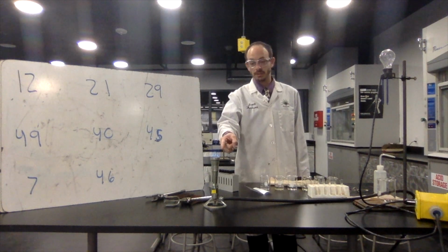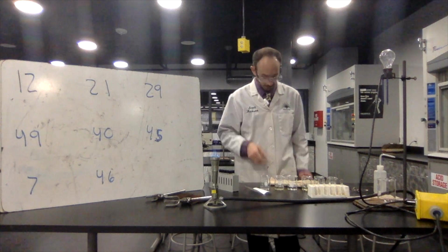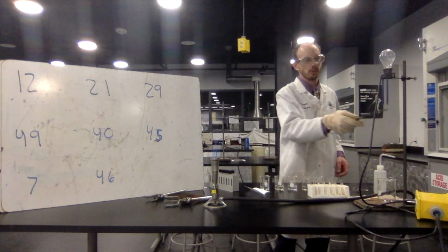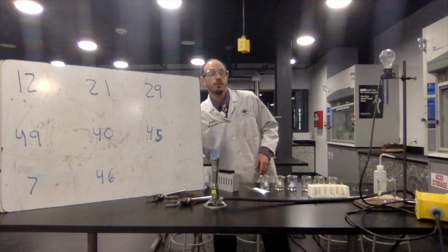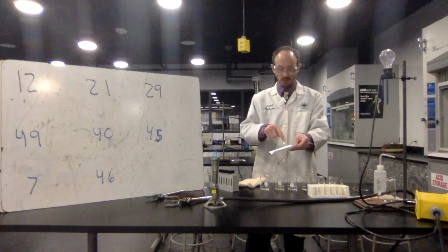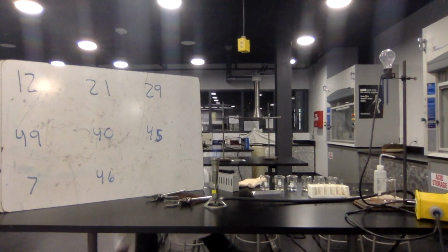We have a flame test that's going to happen right here so that I'm going to try to do the melting point, boiling point. We have over here a light bulb so that I can test the electrical conductivity of the substance as well as its electrical conductivity inside of water. Okay? I have these papers right here which I'll put the material across. It'll make a straight line. I'll show you that line over there so you can see the material's actually there, because I do have a second camera set up to kind of show you some zoom-ins of what I'm going to be doing.